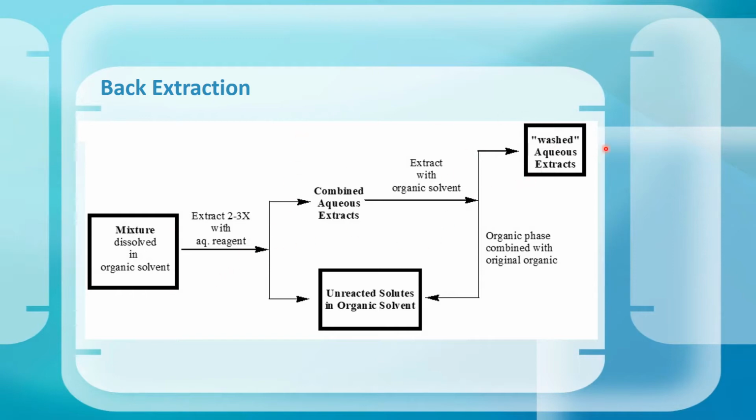And oftentimes you test the pH of the material to see if you're still getting neutral sort of pH out, because if it's got the bicarb, it should be turning kind of a more basic color if it's bicarb heavy. So sometimes we check with litmus paper and things like that and see if we're close. And you try to kind of calculate based off partition coefficients and things to see if you're kind of around where you should be, solvent wise, so you're not wasting too much material. You can get into some little bit of calculation like that to see if you're in the ballpark range of where you need to be. But it really does depend on the exact measurements for your solutions you're using. So if you're just even a 0.5 here or there off, it could really affect your outcome when you're trying to make a theoretical calculation like that.